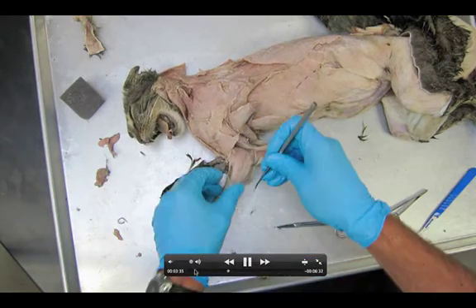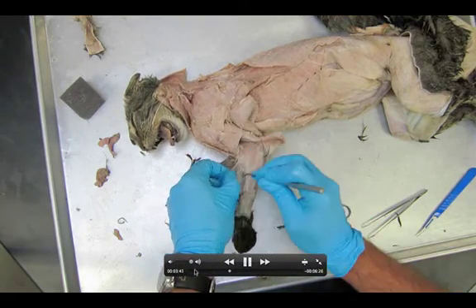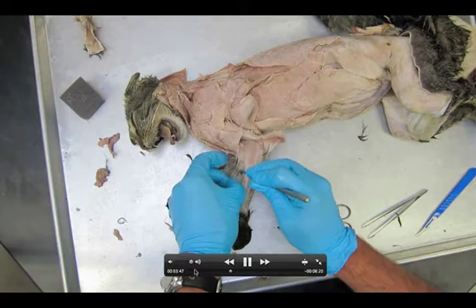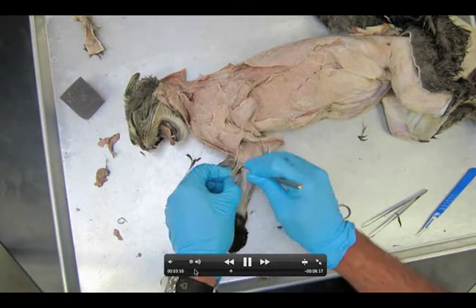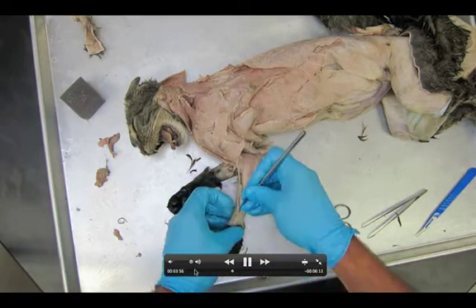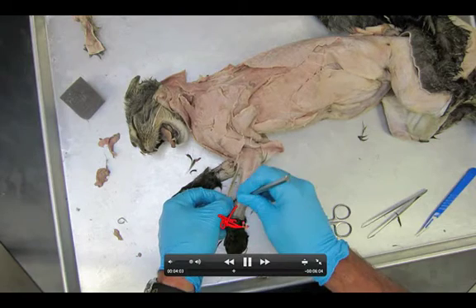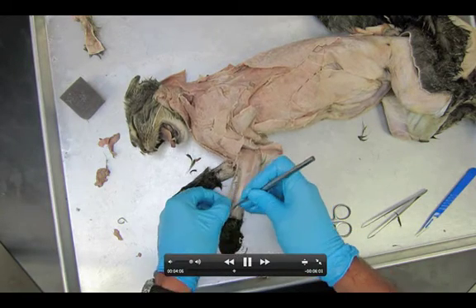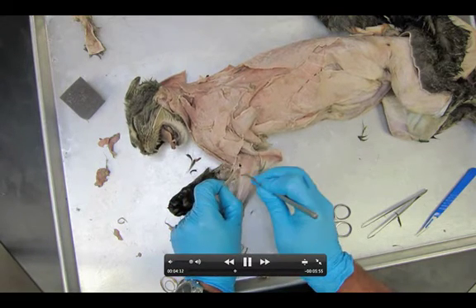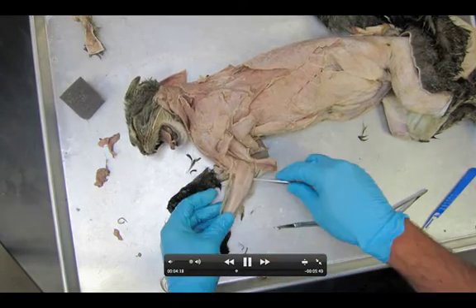I'm getting my probe underneath the brachioradialis. It's an extremely thin muscle, super easy to tear, so be careful. Some of you, if you've already torn this muscle while removing the skin from your cat, go to the other side and do this dissection on the other side. Ideally you're doing this arm dissection on the same side you did the shoulders, abdomen, and chest. It's a nice ribbon — I'm working all the way down to the wrist where we removed the fur. If you haven't removed enough fur down here, you need to peel back more to see all the way to the wrist. The brachialis up here — you don't need to do anything to it, you just need to know where it is.